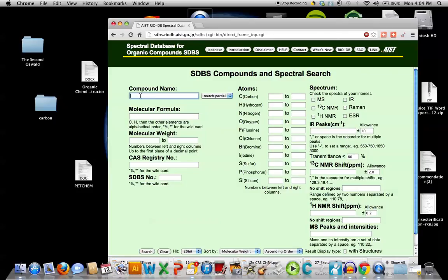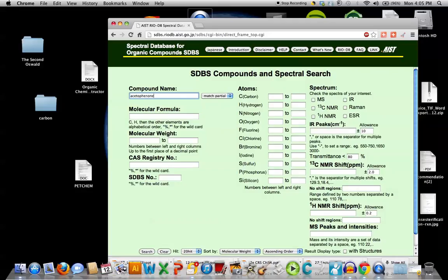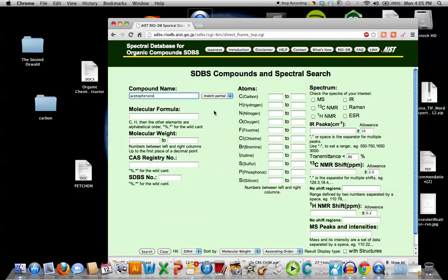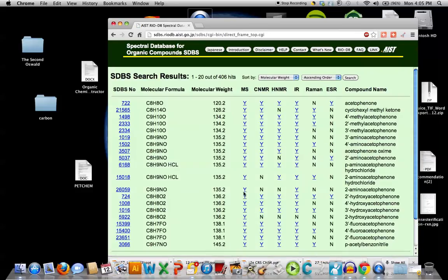Here, let's type in acetophenone. Acetophenone, as you know by now, can be synthesized by a Friedel-Crafts acylation with benzene and acetic anhydride or acetyl chloride, aluminum chloride catalyst. But here we're interested in structure determination. So we'll hit acetophenone, see what comes up.